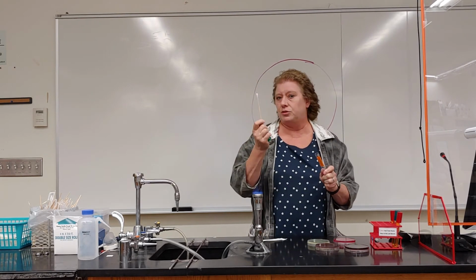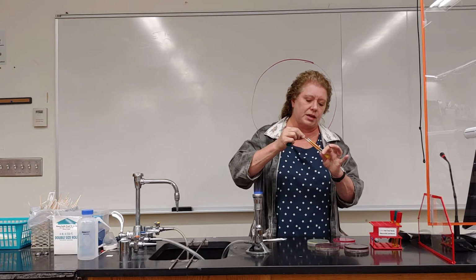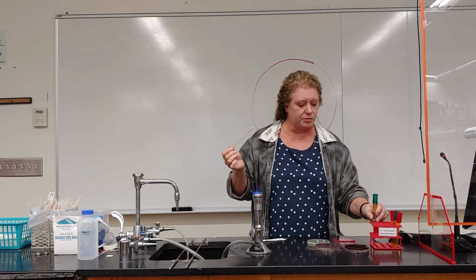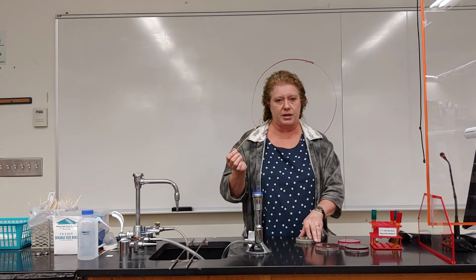Flame the top. Okay, you don't have to cool this because it's cool. Go in and soak that swab in the bacteria. Come out. Flame the top. Put the lid on. Put the E. coli down. Okay, and we'll take the first plate, which is our PEA plate.